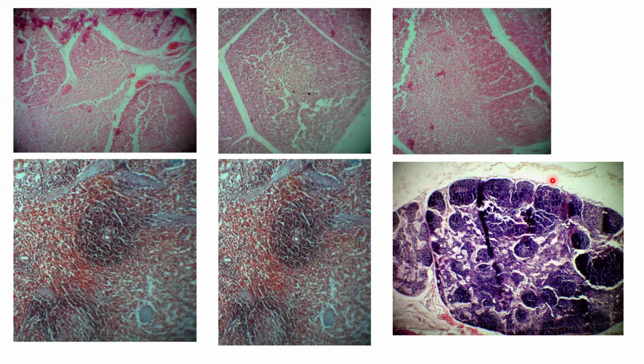And then I hope you can identify this. It's actually bean shaped. This is the hilum with the efferent vessel. Then at this point, you can see the capsule. This is actually the cortex, the medulla. So which organ is this? I hope you're able to answer that this is the lymph node. You can see how the medullary sinuses come in, draining into the efferent vessel. So around the concave part, the convex has the afferent vessels, the concave the efferent vessels.